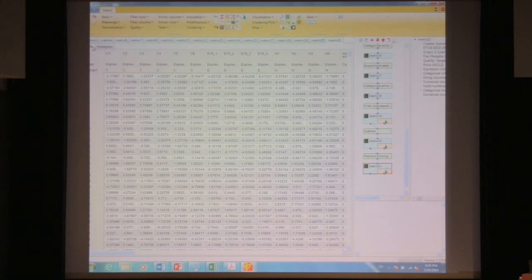You won't get into trouble because the algorithm is extremely simple. It's just taking the mean and standard deviation, and then you make a new distribution with these prescriptions. Nobody can say one cannot understand what's going on there.